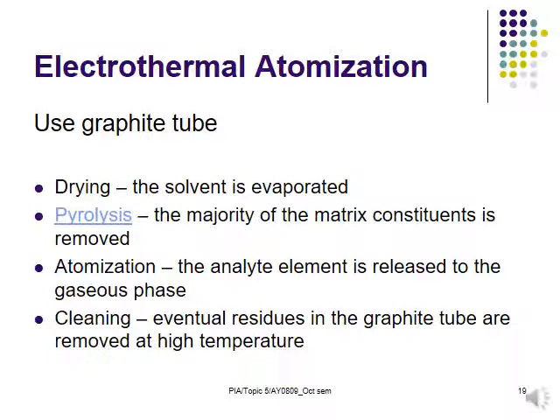Now in the graphite tube we have drying, to evaporate the solvent. We have pyrolysis, the stage where most of the matrix constituents will be removed.